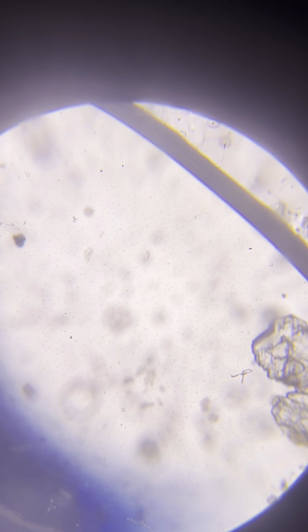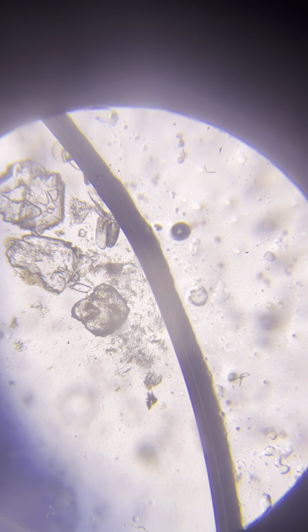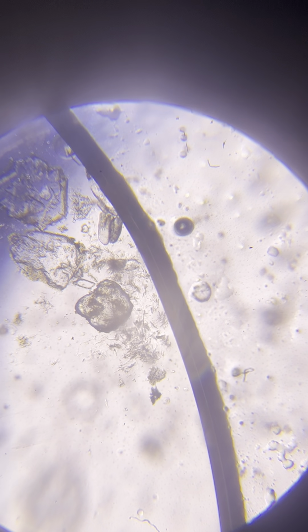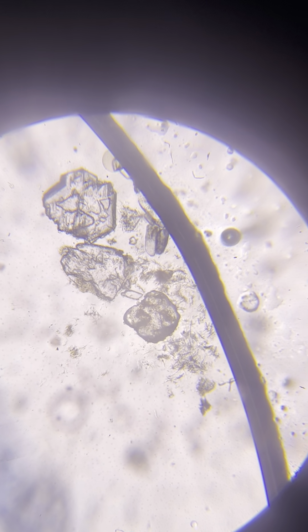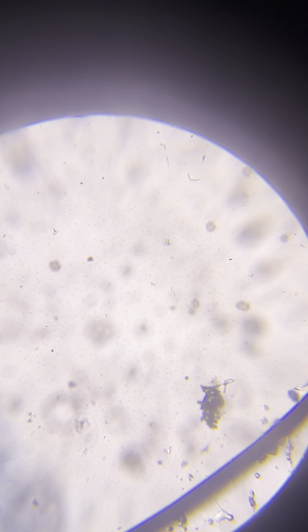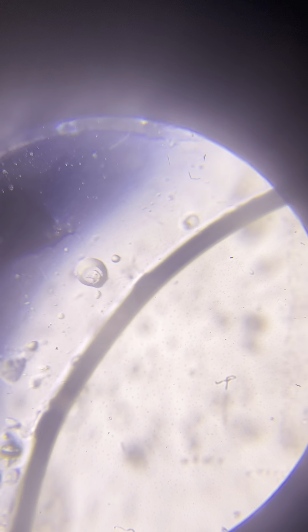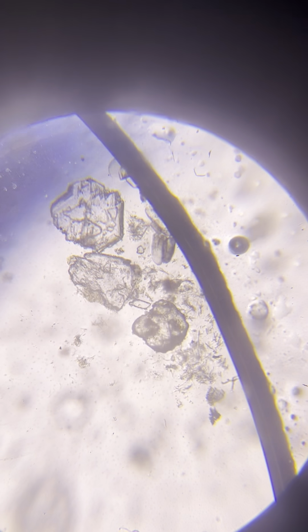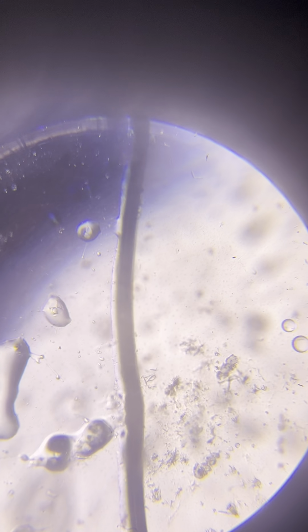You see, it cannot be fitted in frame, even with the minimal magnification that I use, that is 64. This body is probably something you can see by the naked eye if we have very good backlight and we get the slide close to the eye. I suspect that this falls under the category of not a nanobot and not a microbot, but actually a robot. What you actually see here is a robot, which is very exciting. A very, very small robot, but indeed a robot. I'll try to do it when we finish this review. I'll try to watch it with the naked eye. It's going to be extremely difficult, but my guess is it's possible because this is 64 magnification, so do the math. It should be within the level of being able to watch it with the naked eye.